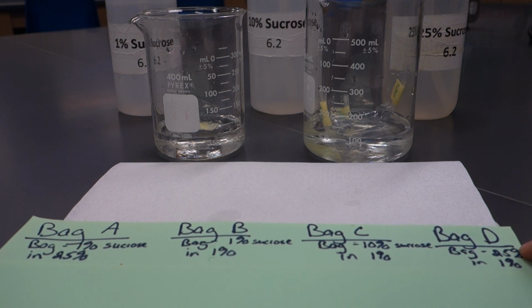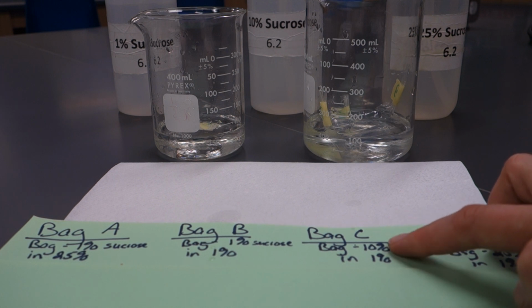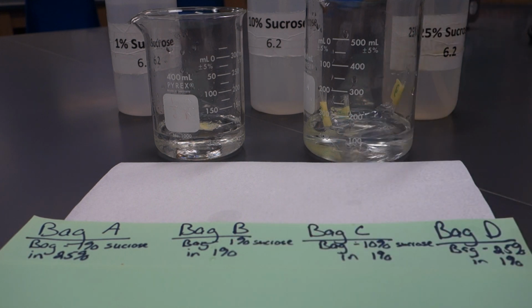Now bag D is the most dramatic here, right? It has a 25% solution of sugar inside of the bag and only 1% outside. 10% for bag C inside, and then again 1% on the outside. And then a 1% and 1% for bag B. So that means B should be what we would consider our isotonic solution because bag B has the same amount of sugar in it as there is outside of it. So we'll see what happens with this.